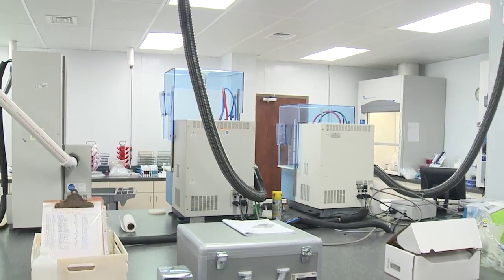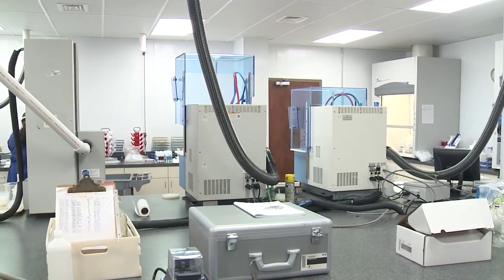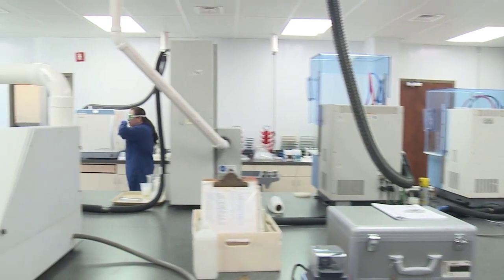So these machines are sophisticated extractors? Is that what they're doing? We call them digesters. Digesters would be a better term. We use acid, heat, and at times pressure. Those will apply pressure to break down whatever it is, whether it be a clay-based material, whether it be a pill. You take some aspirin, break it down into a clear liquid.